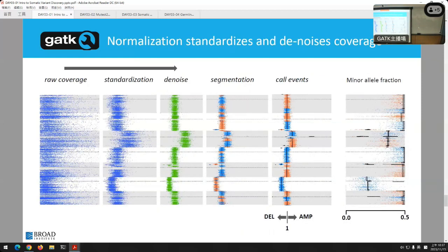Here's an example. The way to kind of view this, and I'll show you again this afternoon, is flip it over on its side. So on this left panel, here is the beginning of the genome, and this is the end of the genome. We couldn't fit it all the other way, so I turned it to its side. And each one of the dots is the average depth of one exon in the genome. So for every exon, there's one dot.